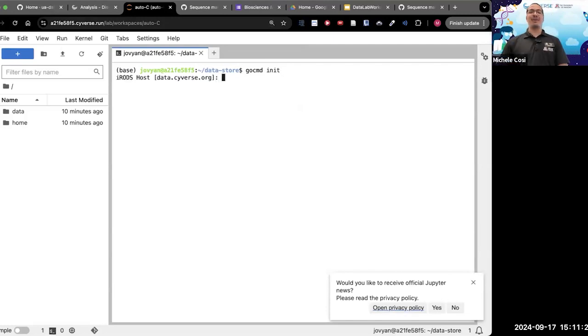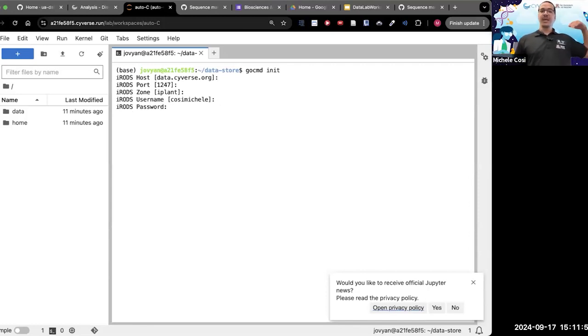Press Enter, and now it's going to ask iRODS host. What are you going to do? You're going to press Enter. iRODS port 1247. You're going to press Enter. iRODS zone. You're going to press Enter. And if it does say iRODS username, your username, you can press Enter. If it doesn't say your username, please put your CyVerse username. And when it says iRODS password, please type your CyVerse password.